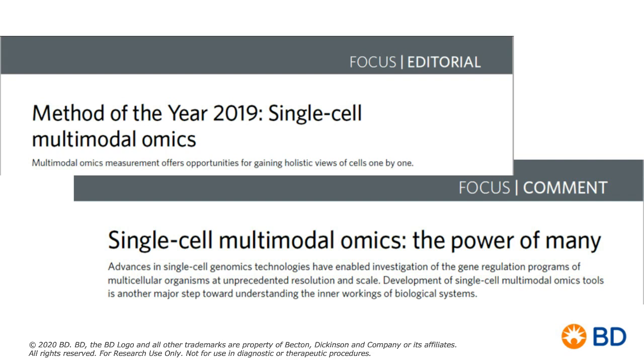There's also a question regarding types of cells and variability of cell sizes that the cartridge can accommodate. Joe, can you make a comment on that? Yeah, sure. Like any single cell assay, regardless of the platform, viability is absolutely critical. In terms of cell size, there is a point where, whether it be a droplet or a microwell, you eventually cannot accommodate larger cells.